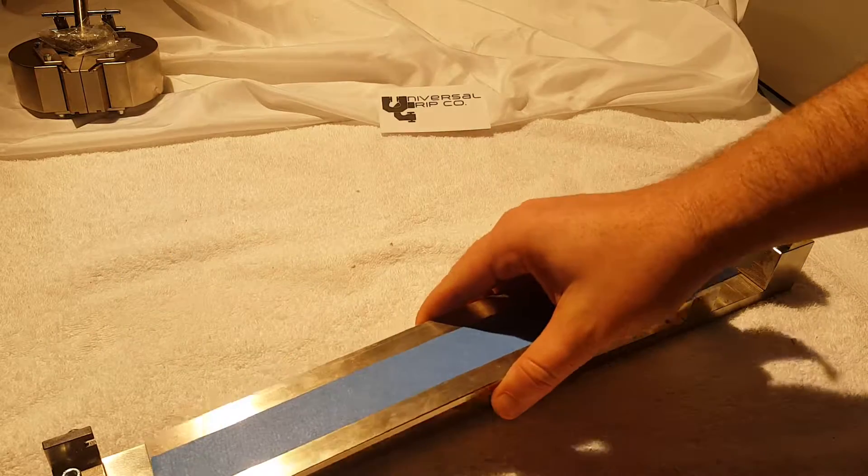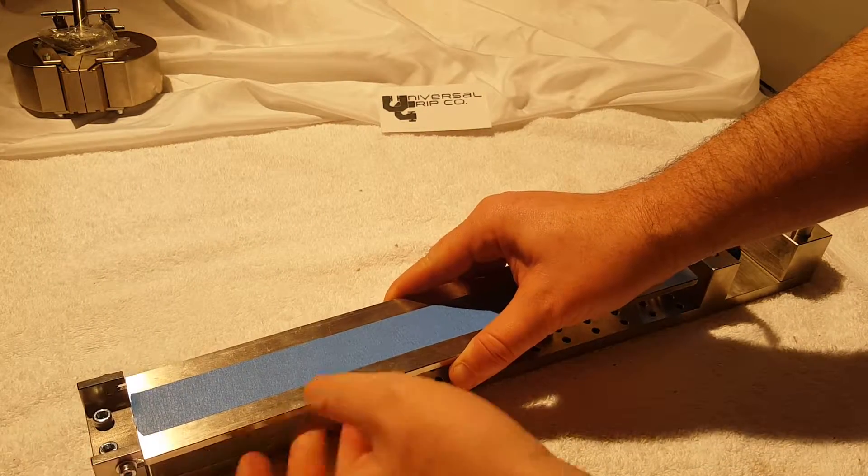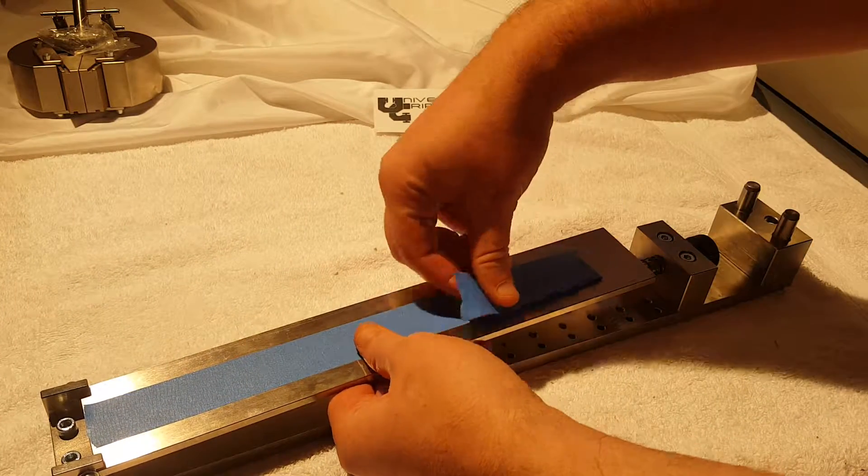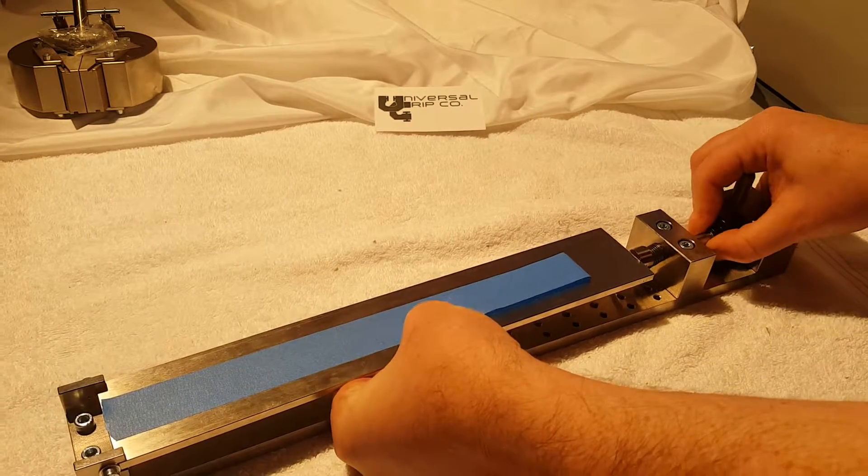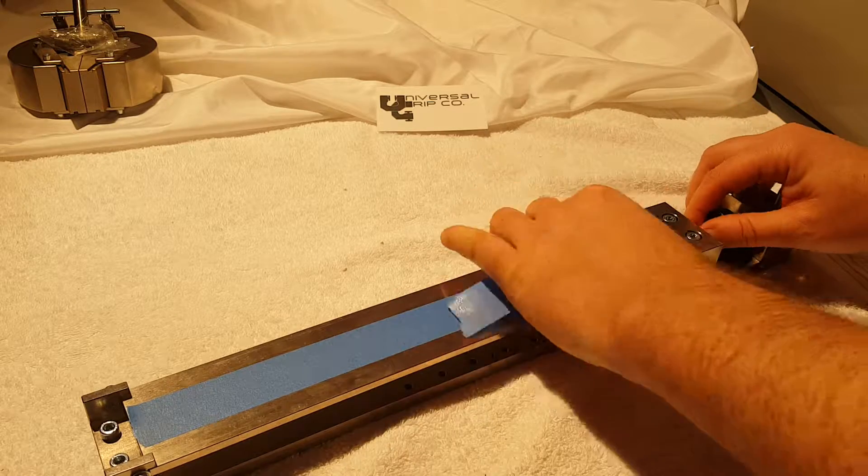Now this plate loads into the fixture. There's a little notch at the end here, and then this spring pulls back. You pull this back and notch it into place just like that.